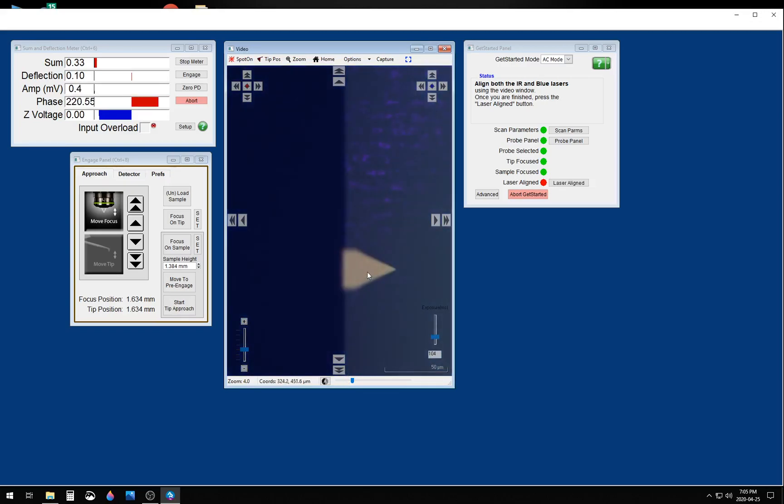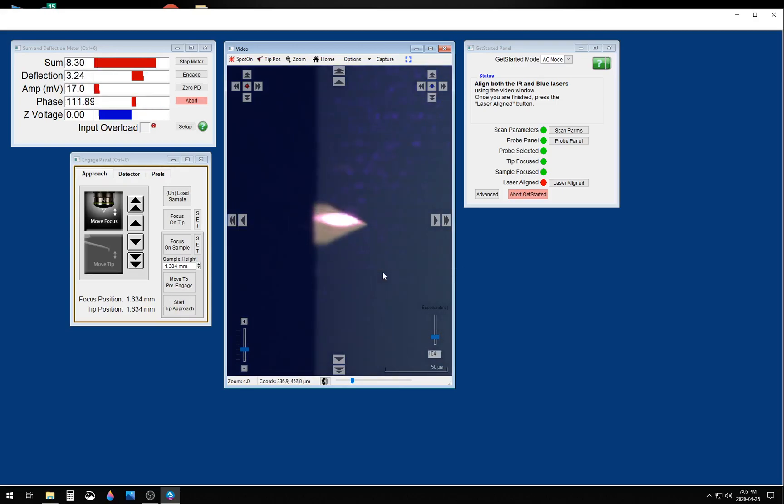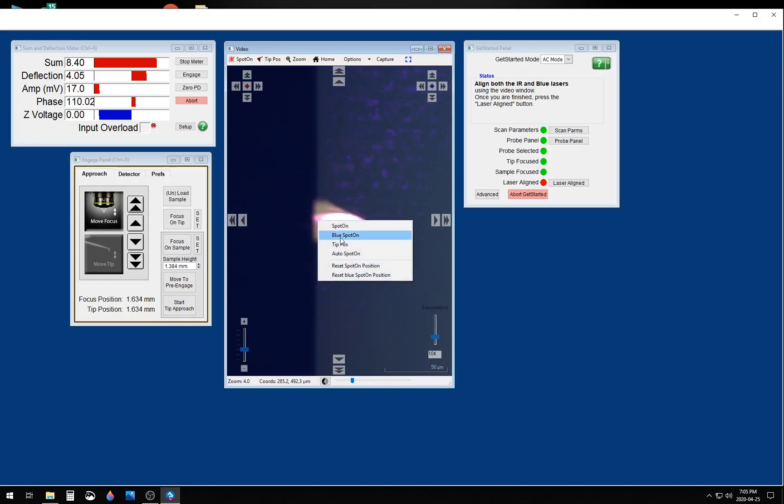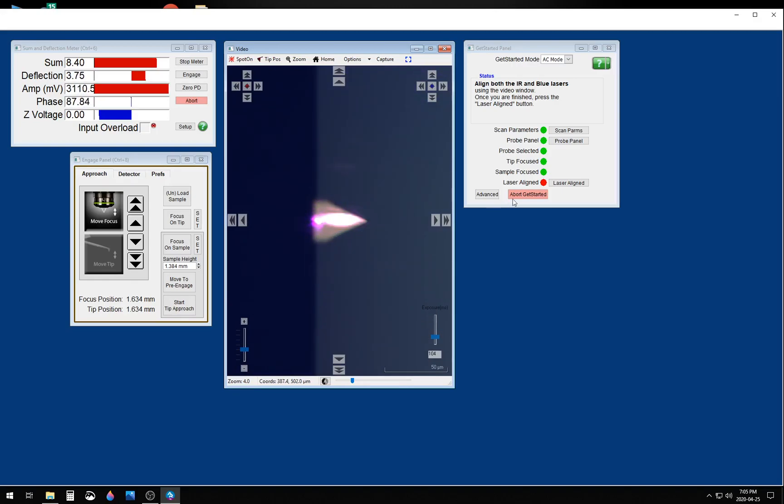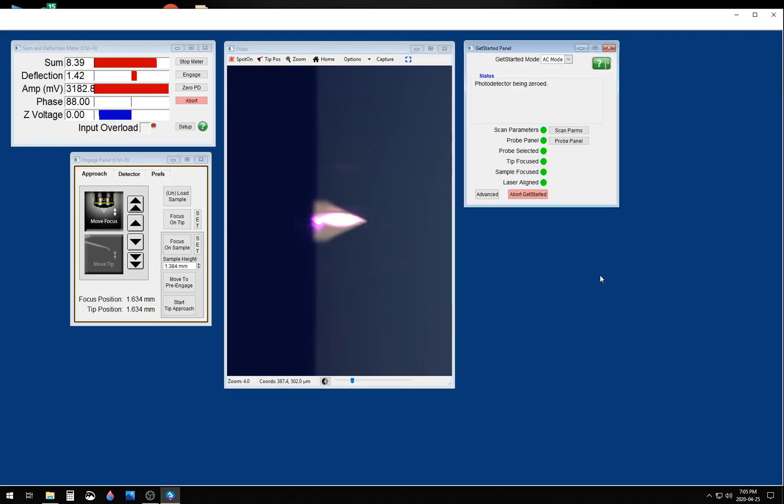Now you want to put the optical detection laser on the back of the cantilever, as well as the Bluedrive laser on the base of the cantilever in order to drive it photothermally. Once you've done this, you can say that the laser is aligned.